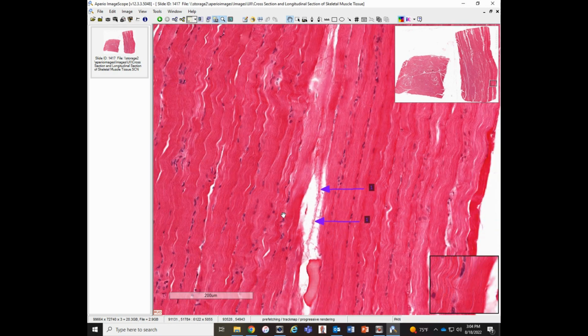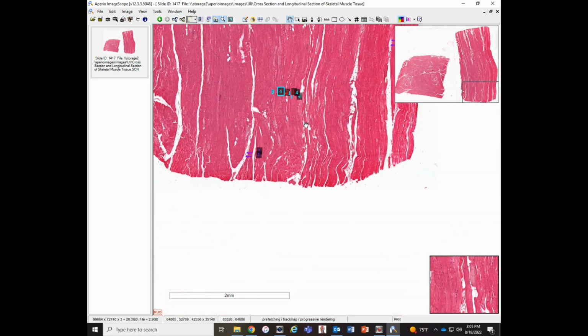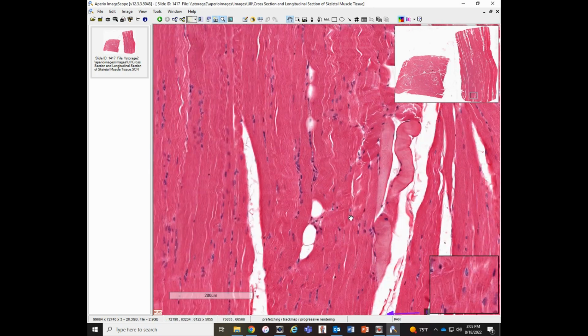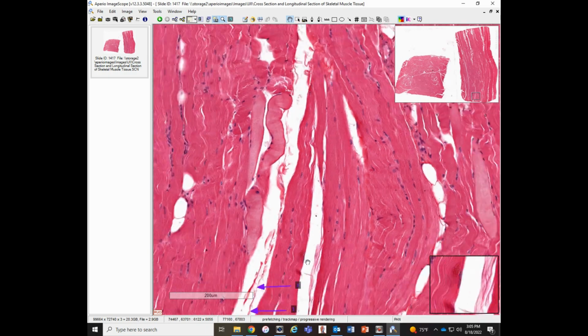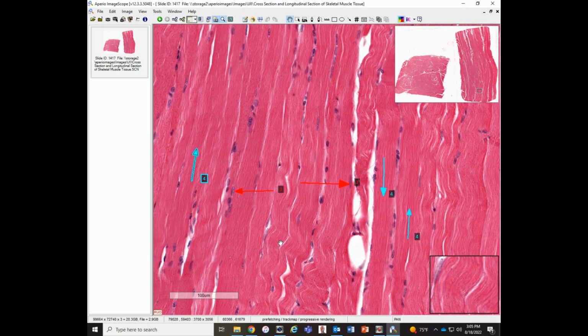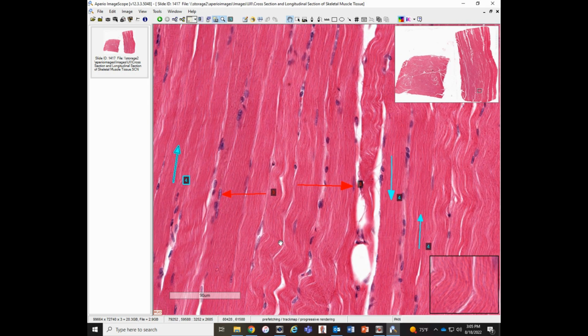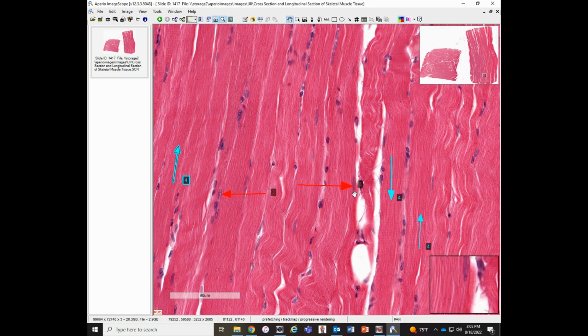And that is perimesium separating nearby fascicles of muscle, groups of muscle cells. Over here, it's actually another. So you can satisfy yourself that that's a very similar thing. And right up here, 3 and 4. So number 3 is indicating the nuclei of these skeletal muscle cells, and 4 is indicating the cell itself, its cytoplasm packed full of striated filaments made up of actin and myosin.